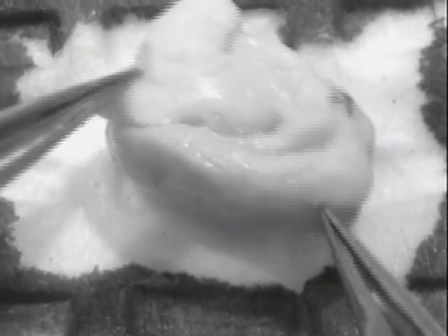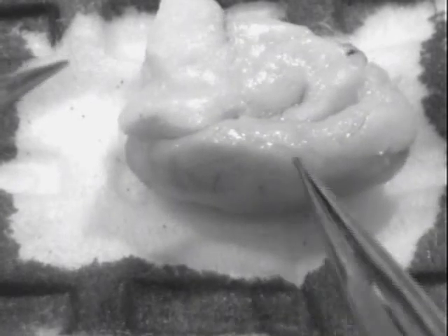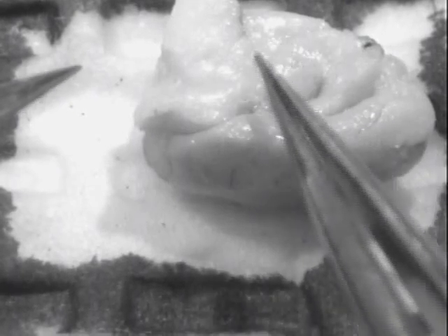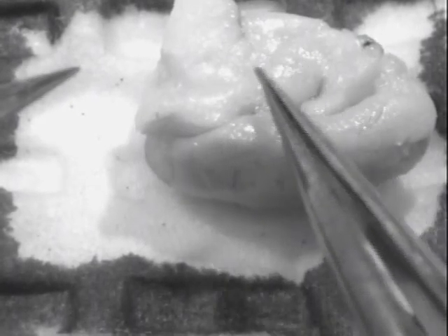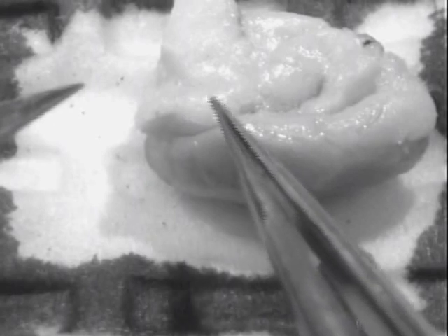I've flipped the brain over and you're looking at it basically sagittally. At the bottom here is the cortex — this is actually the dorsal surface of the mouse brain. This is the striatum, this is the thalamus, and then back here you basically have midbrain and brain stem.